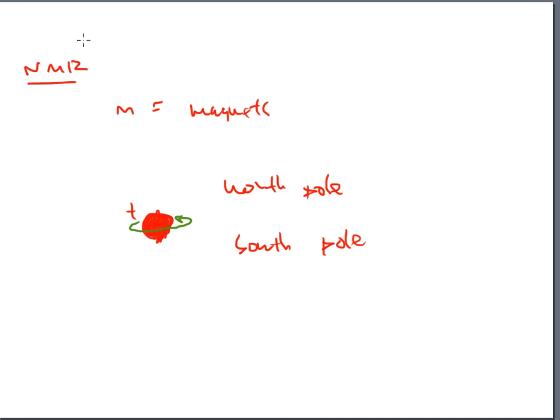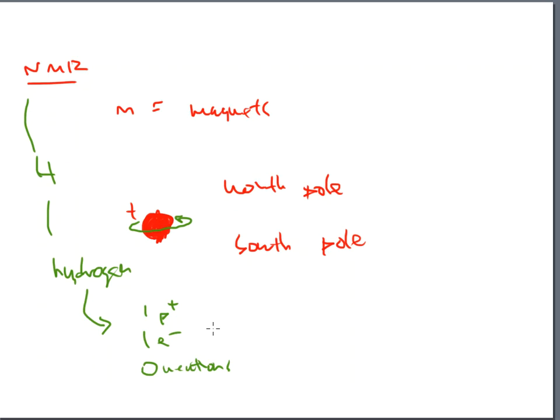And the reason that we start with H NMR is because H is hydrogen. And let's think about hydrogen for a minute. Hydrogen from the periodic table has one proton, has one electron, and has 0 neutrons. That was something that we learned how to calculate in general chemistry. Look at your atomic numbers of the table. Hydrogen is atomic number 1. And that 1 up at the top means 1 proton, 1 electron, and it has a mass unit of 1. So mass of 1 minus the atomic number 1 is a 0.